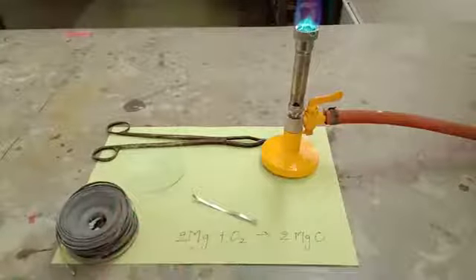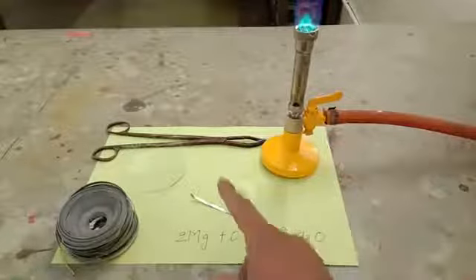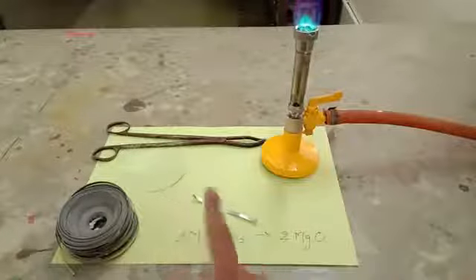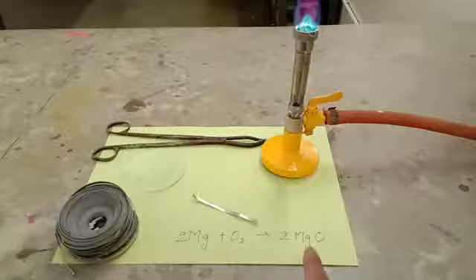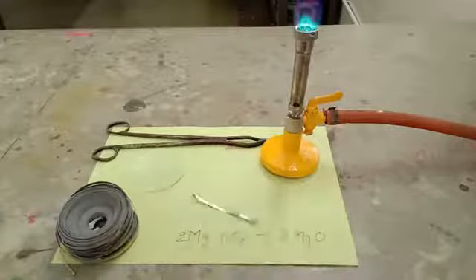This is the magnesium ribbon and this is Bunsen's burner and a watch glass in which I am going to collect the magnesium oxide which is white in color. These are the pair of tongs.